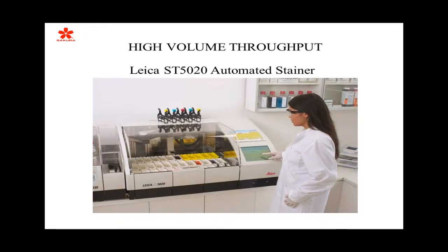These staining systems are most beneficial for high volume throughput stainers. And I'm just listing two examples here. I'm certainly not promoting either one. I'm just saying these are high-end, high-throughput stainers. The first one that I'm showing here is the Leica ST5020 stainer.